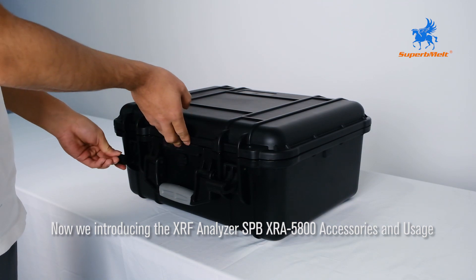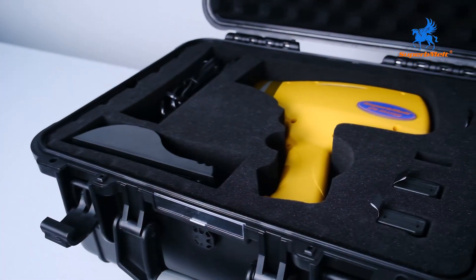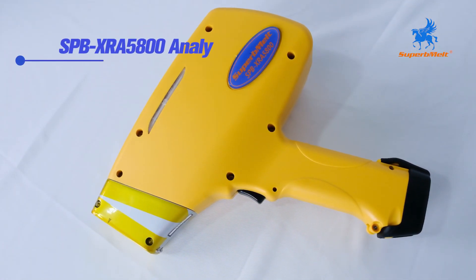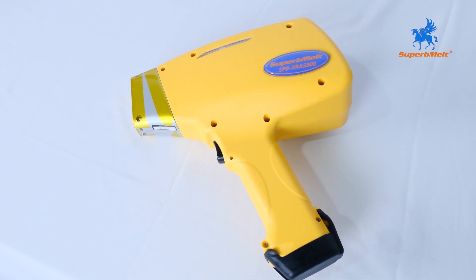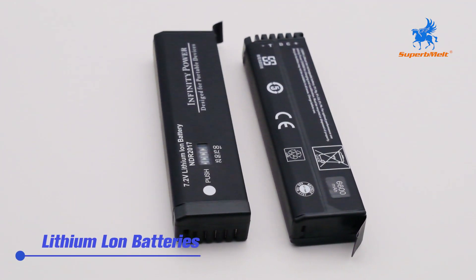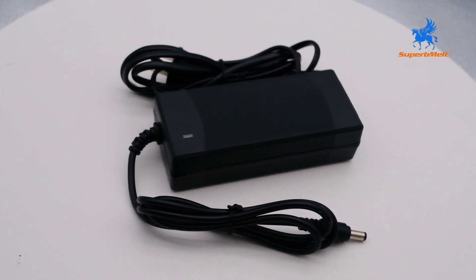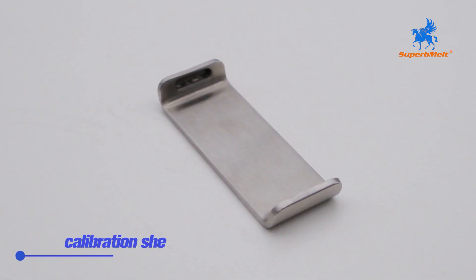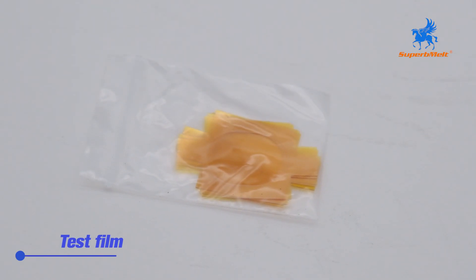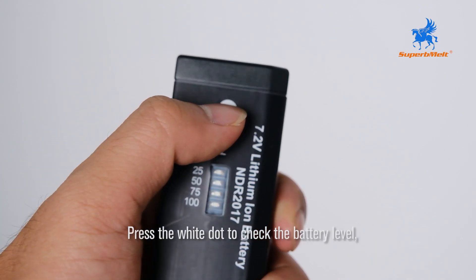Now we are introducing the XRF Analyzer SPB XRA5800 accessories and usage. When you open the box, it contains the analyzer, battery charger, lithium-ion batteries, power adapter, calibration sheet, touch screen pen, and test film. Press the white dot to check the battery level.